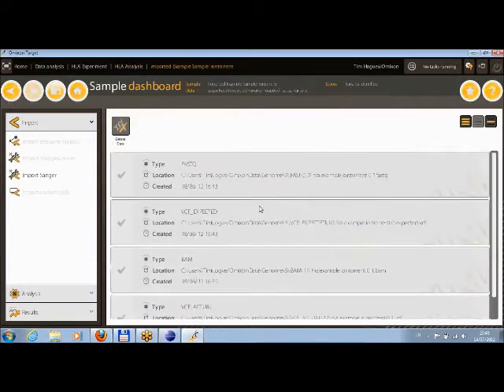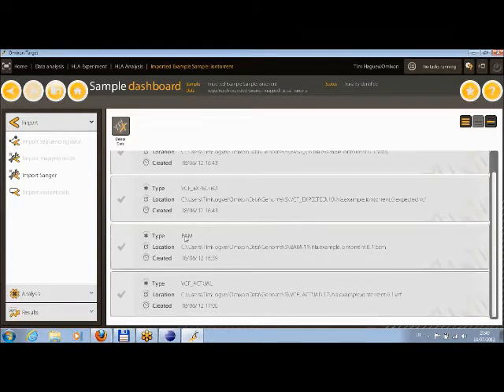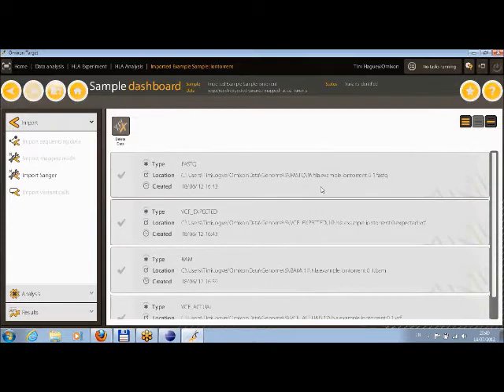And I click on this one, and earlier on I actually took the FASTQ data that was imported automatically within the profile and I mapped it, and this is showing the mapping for the data and the actual results. Because this particular data set is done with simulated data, we also have some expected results. Also, if you have Sanger sequencing for part of your target region for a particular sample, you can import the VCF variant calls as expected results in here.